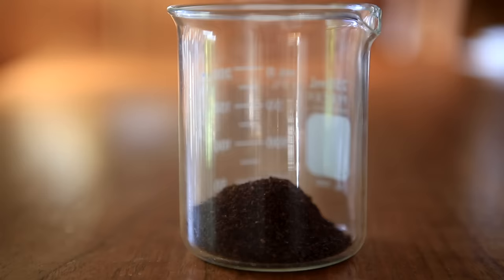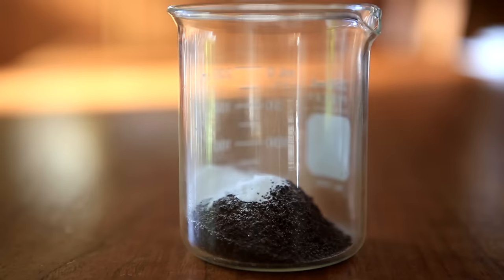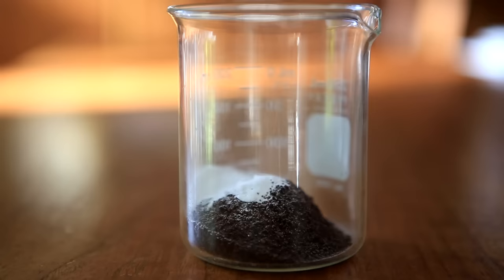I started off by adding 10 grams of ground coffee. Then on top of the coffee I poured on about 4 grams of sodium carbonate. The sodium carbonate will react with a lot of different molecules in the coffee and make them more water soluble. Then 60 milliliters of distilled water is poured in.